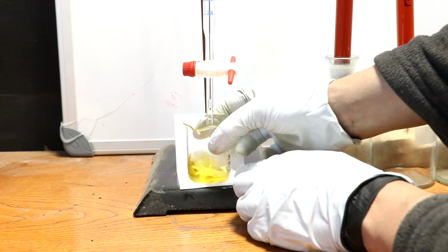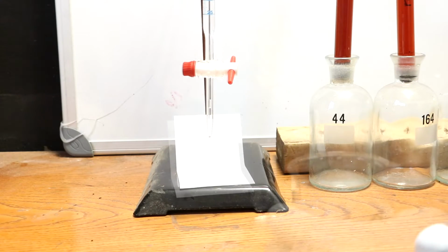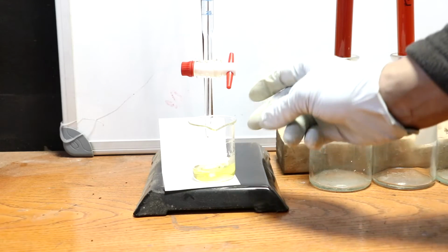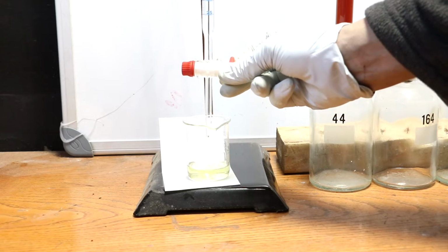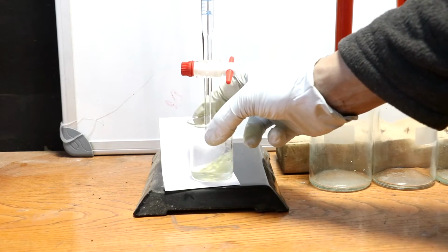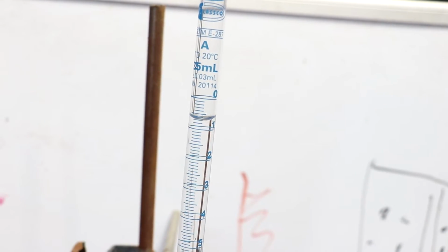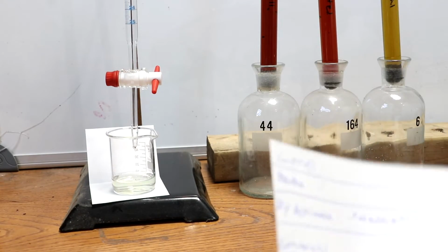Just let it out a little at a time, give it a stir. Oh, there's a bubble. No, no, no. Okay, crisis averted. Doing this pretty much just dropwise until the solution goes clear. Ooh, it's almost clear now. There it is. That took 0.7 milliliters of the thiosulfate solution. So I just wrote down that result here, and I guess it's time to work on the other three.